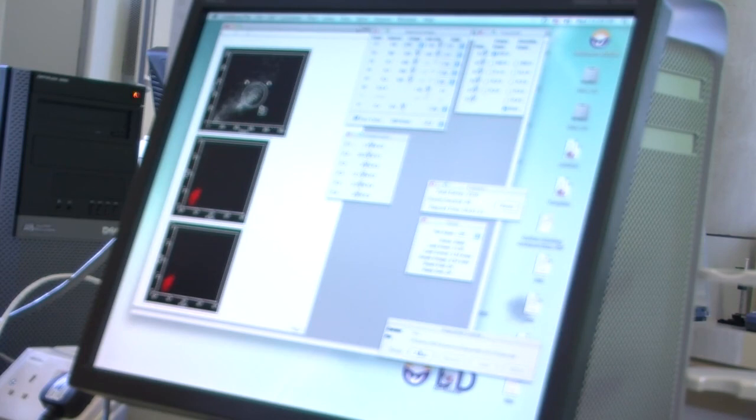When you've been doing it a lot, and you've got 40 tubes and you've got to aspirate, you end up rushing. Well, yeah, I've done that when I've been in a hurry. I've actually spun them down, poured the supernatant off, given it a quick tap to get rid of it, added my antibody, re-spun it, put it back in, just because I'm in a hurry. Now, is it optimal? No, not really. But again, sometimes, and I'm not recommending that for a moment. It's all about adapting. You have to do what you have to do sometimes. And it may not be optimal, but sometimes you have to just because you have no choice.